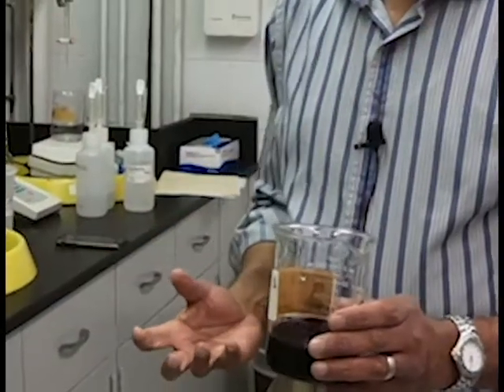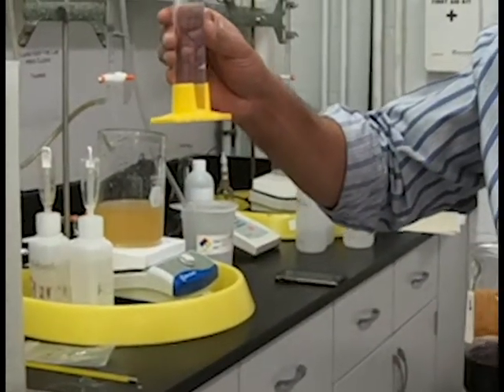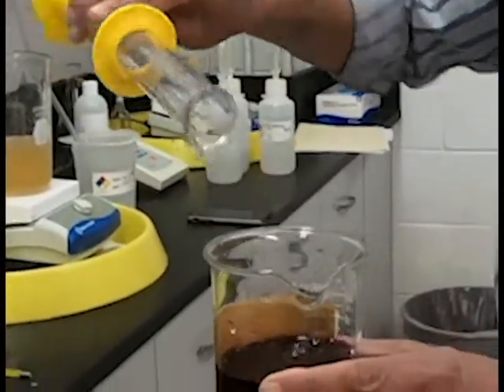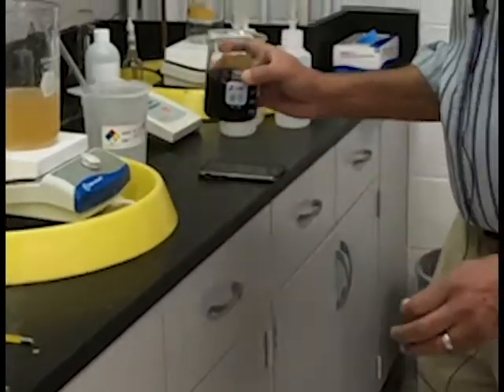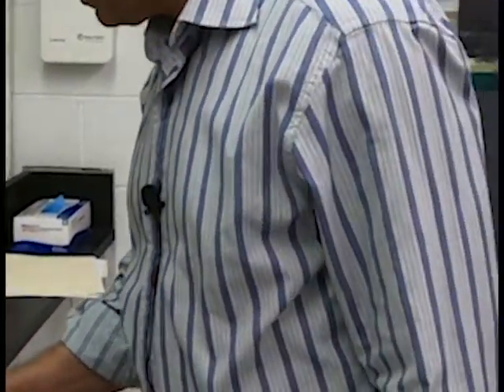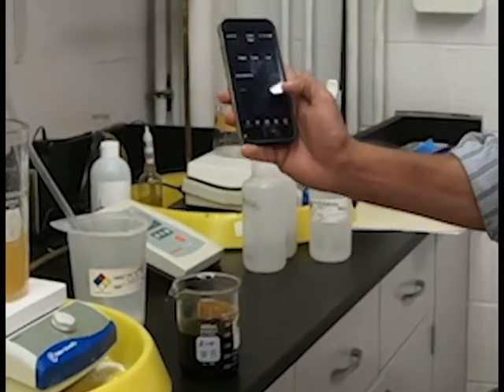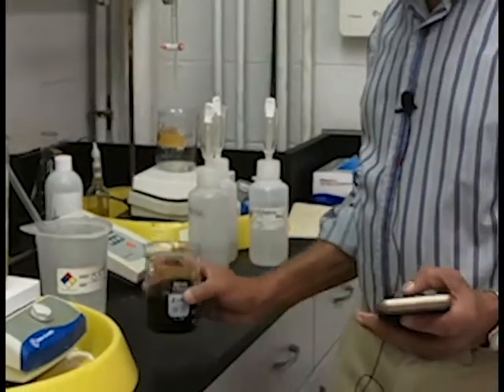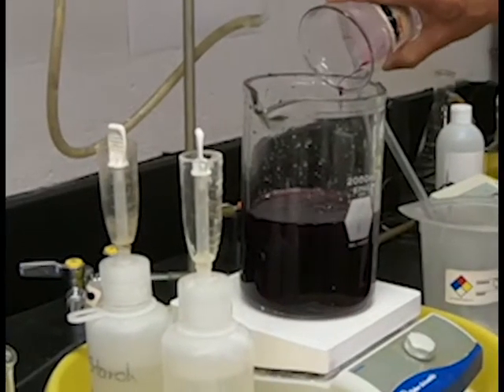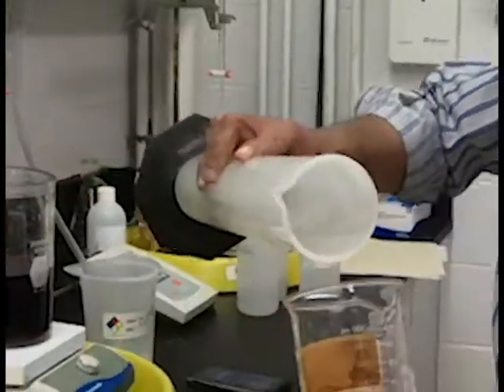Now that we have the permanganate, I'm also going to add 100 milliliters of 4 normal sulfuric acid, because for the permanganate to react with the lignin in the pulp, it has to be under acidic conditions. Now that I have the permanganate and the acid, I am going to put it in, but I have to time the reaction for 10 minutes. So I'm going to take my cell phone and set it up for 10 minutes.